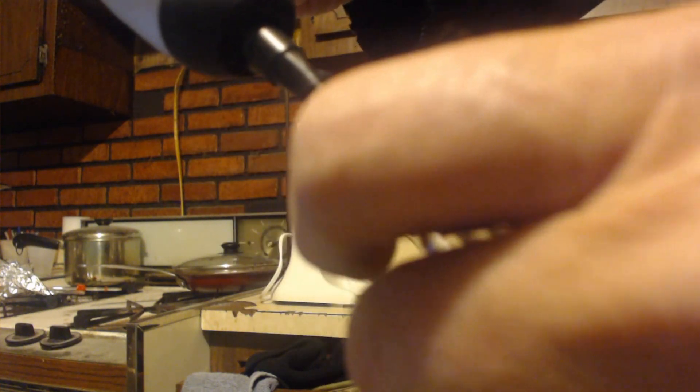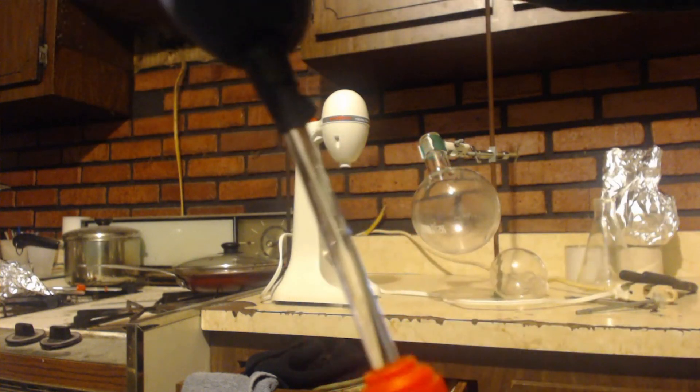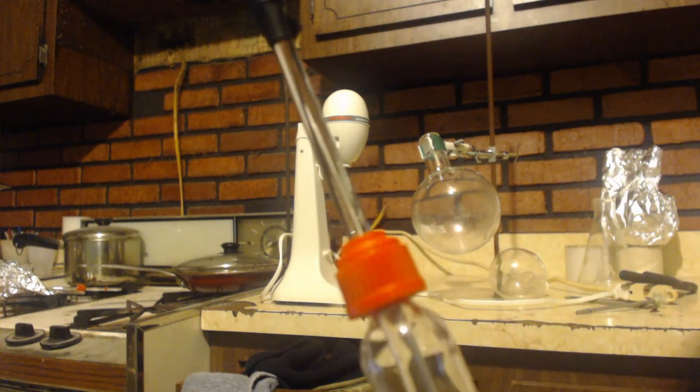See, these have threads on there and threads on this red thing, and then the gasket's in there. And as you tighten it, it will squeeze that gasket even smaller, but it's just the perfect size for this glass rod I have.